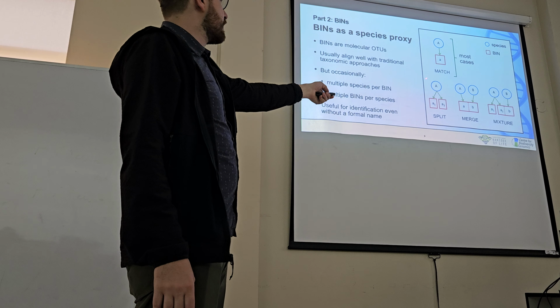But what you can do if you want to see the specimen: this is actually one that Jorge collected in northern Peru. You can see here, that's the actual barcode sequence right here. So that right there is the series of A's, T's, C's, and G's that Jorge found for that specimen's barcode.